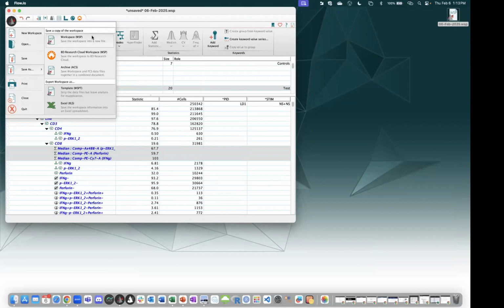When we click and drag the sample into FlowJo, what you really do basically is tell FlowJo where your FCS file is located. So FlowJo will never have the FCS file inside FlowJo. It's just going to point to your FCS file to get the information required to show your graph and calculate your stats, which is the reason you don't really need a powerful computer to analyze your data, even if you have millions and millions of cells and hundreds of samples.